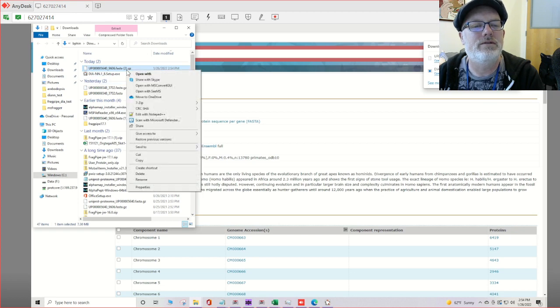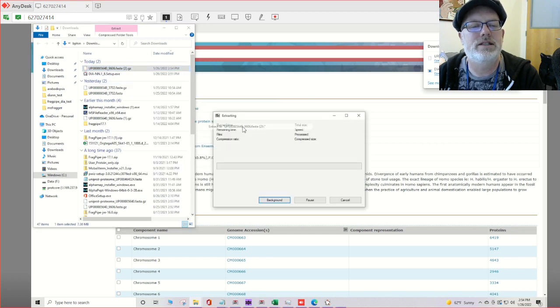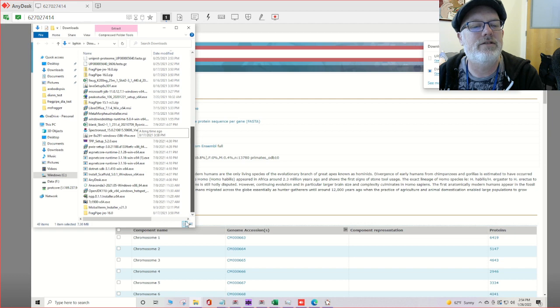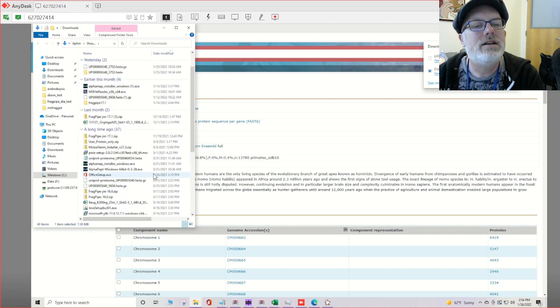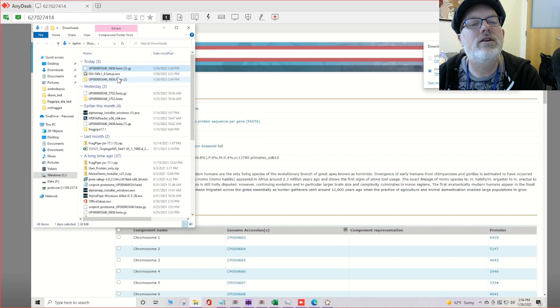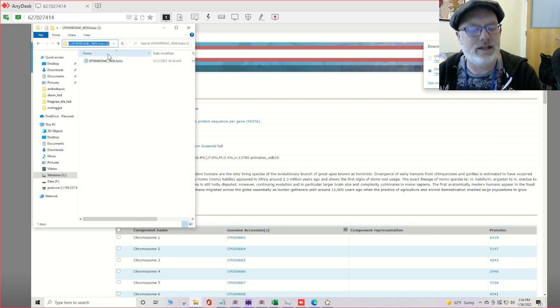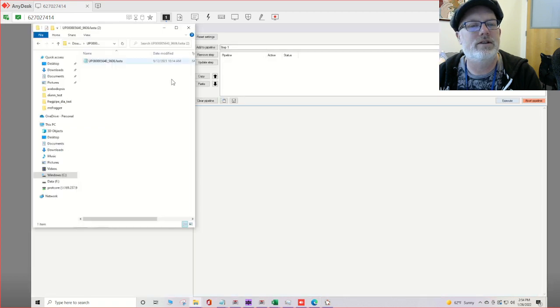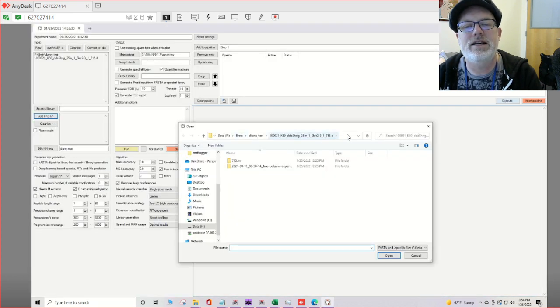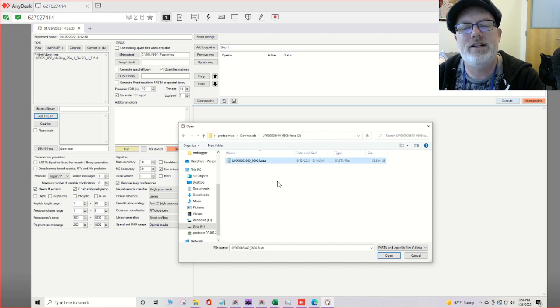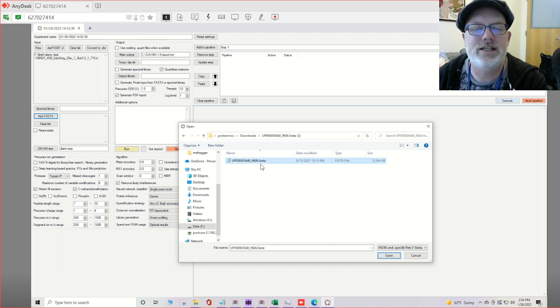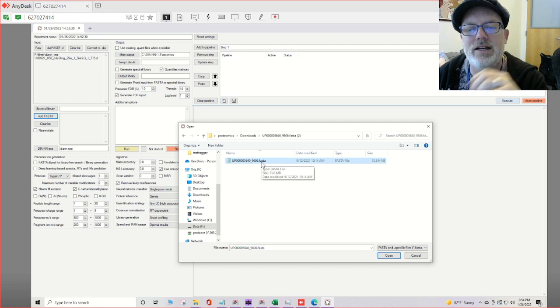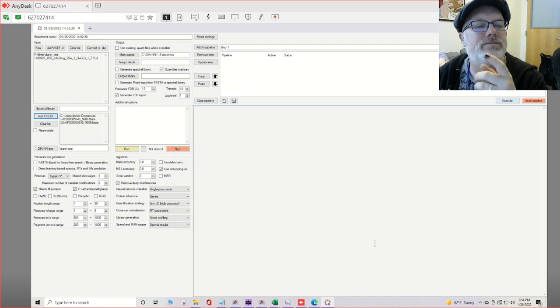And that only takes a second. And we will unzip it into this directory. It looks like I already have one there. Where did it go? There it is right there. And real quickly we will add the FASTA. This is our FASTA file. It'll be 56409606 which is human FASTA. Hit open.